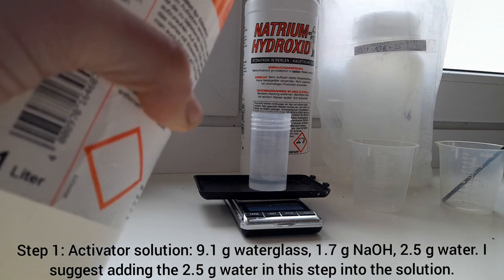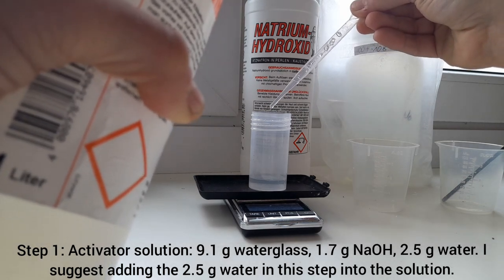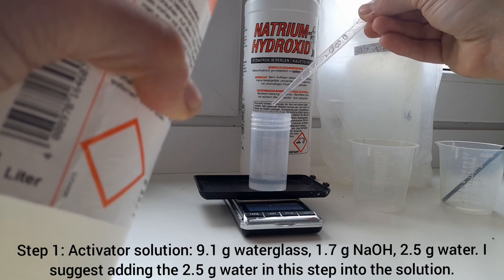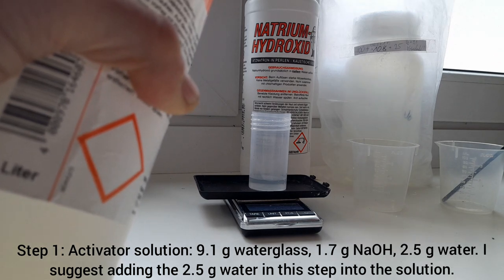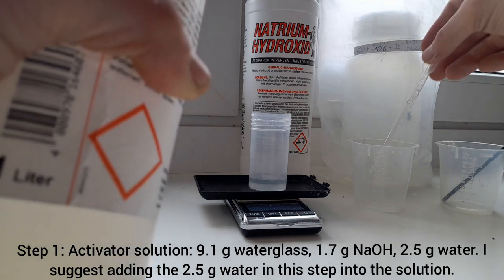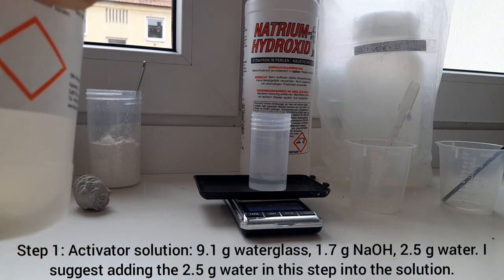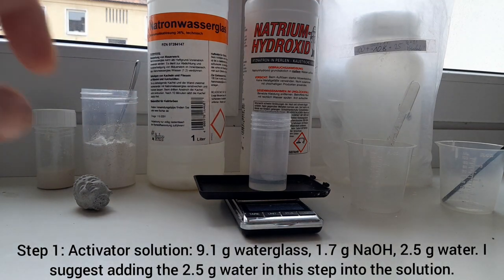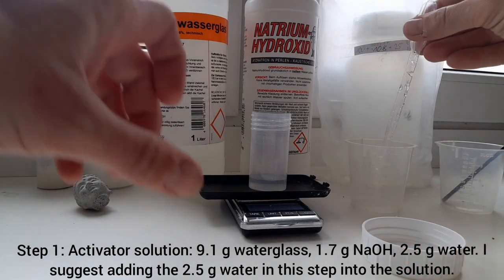Laboratory equipment nowadays is quite easy to get through Amazon or yard sales sometimes. Scales like this are quite accurate and nowadays really cheap, so everybody can get a basic setup for making geopolymer. So now we have 9.1 grams of sodium water glass in the container.